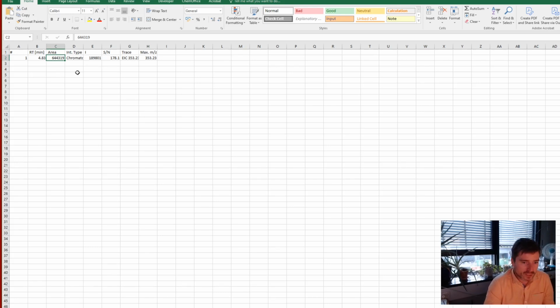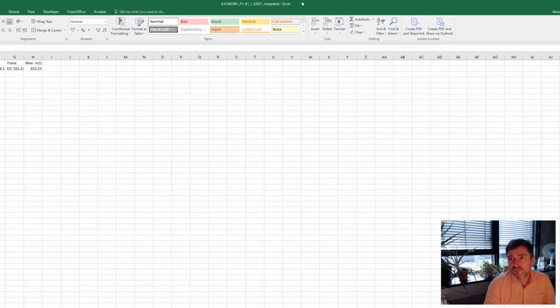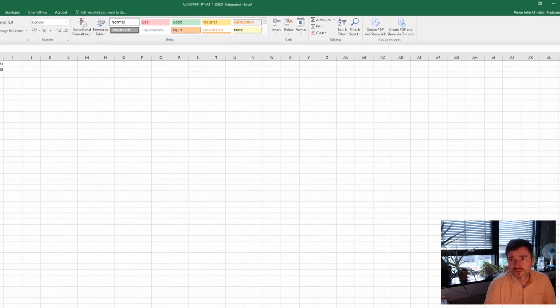But basically what it's doing is just taking off some of this manual labor for you by doing it automatically. But yeah, that's basically all for this tutorial.